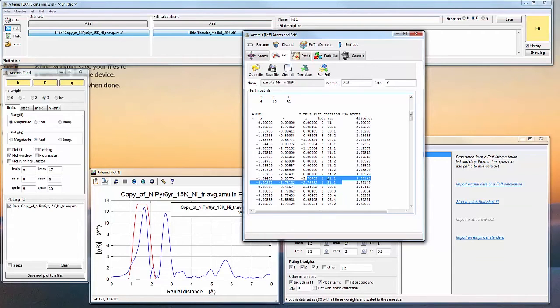And silicon is also very close in the second shell, only about 0.2 angstroms away, as part of the tetrahedral sheet. So this is our second shell, and you can tell by looking at it, it is a little bit smaller than the beta nickel hydroxide, and that's caused by the destructive scattering of aluminum.